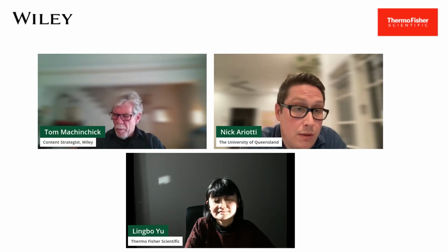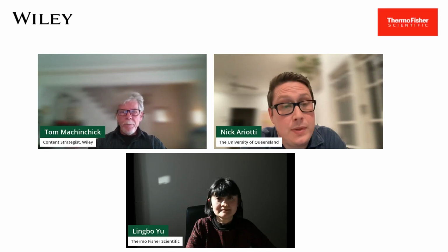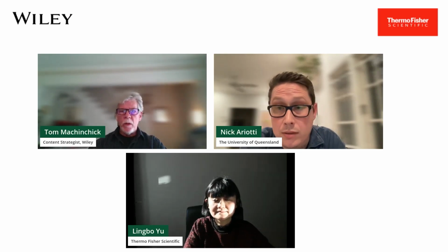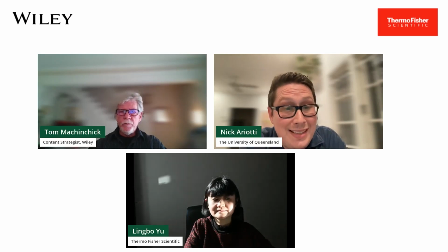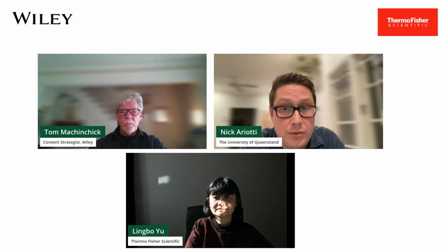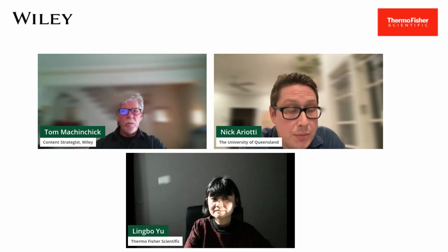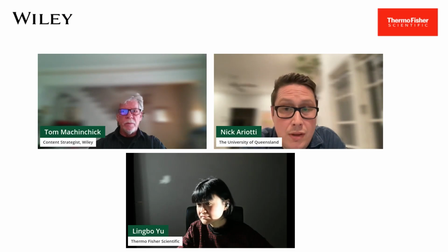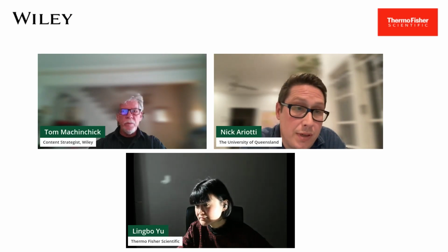These are all freely available, and you can download them and get working basically today. I would say it's challenging to do these things, but certainly not impossible. And this is something that myself and my postdoc, Vikas Tolu, have been working on for the last couple of years. So we start with batch reconstruction.